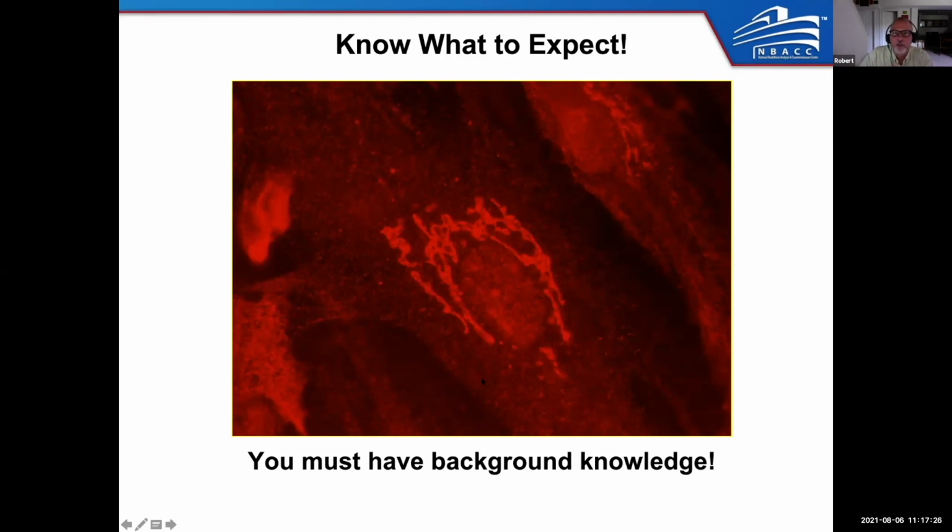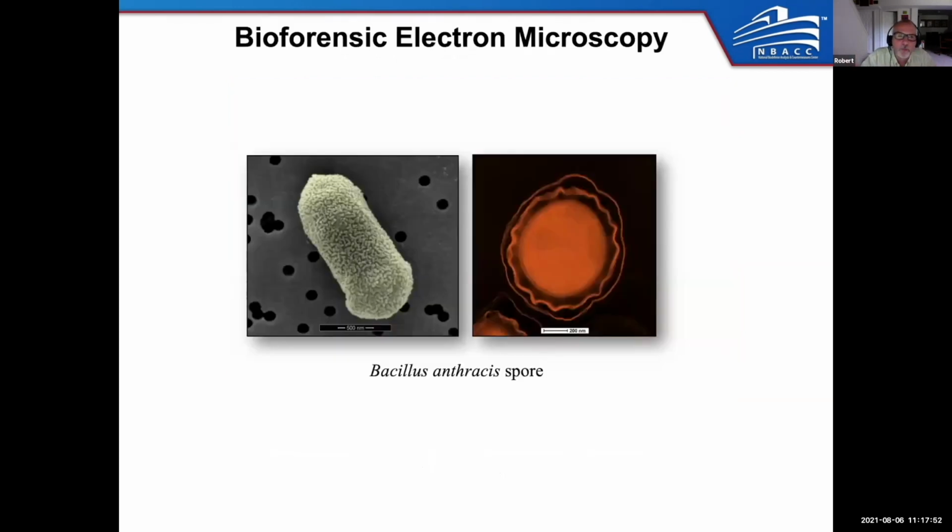And this protein, supervillain, is actually a membrane-bound protein, and it should be localized out here on the plasma membrane. We made several different antibodies against this protein, but this one that gave beautiful endoplasmic reticulum staining is actually simply artifact. So as a microscopist, you have to have a good background in what you should see to understand what you're actually seeing. Okay. So what we're going to talk about today includes more things like this.